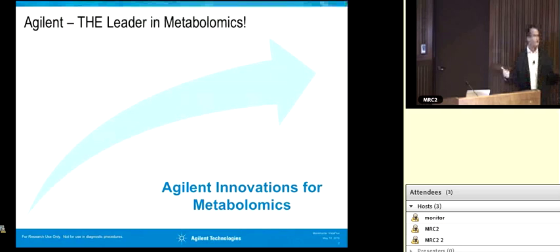It's often good to consult with the local and the not so local experts. When you're going to be the first to market with a new piece of software, it pays to consult with the experts. I like this quote from Nikolai Zamboni of ETH Zurich, and it paints a nice picture of what flux means. His comment is, flux analysis elevates metabolomic studies to a different level. While metabolomics reports on the molecular composition of a cell, flux analysis gives us the in vivo pathway activity. The way I like to think about this is that metabolomics is sort of like an X-ray, right? You can get a lot of information, a lot of content about the composition in your metabolome.